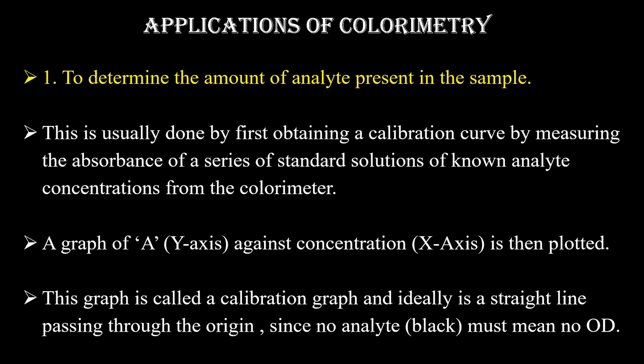Now we'll consider applications of the colorimetry. First application is to determine the amount of analyte present in the sample. This is usually done by first obtaining calibration curve by measuring the absorbance of the series of standard solutions of known analyte concentration from the colorimeter.